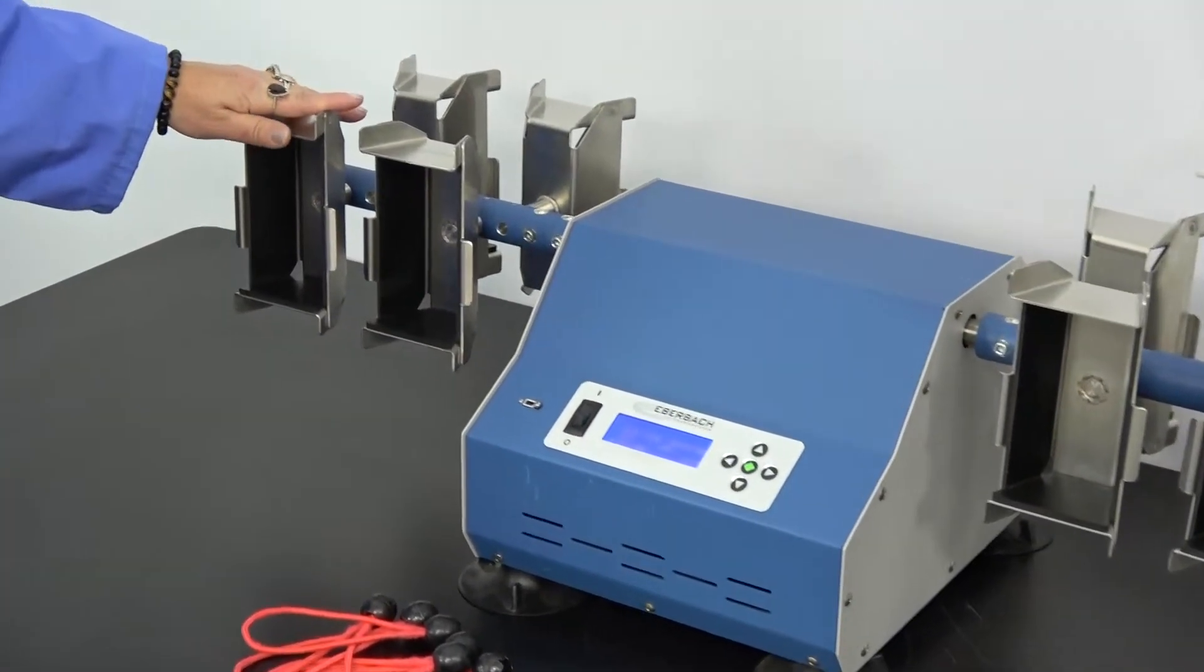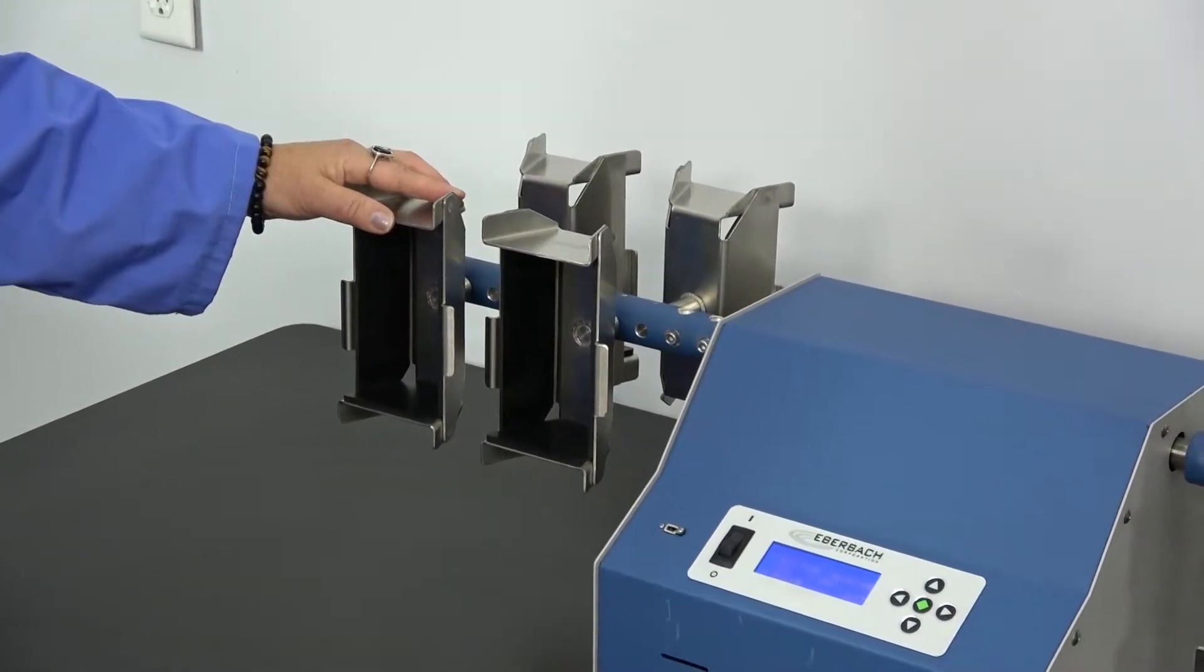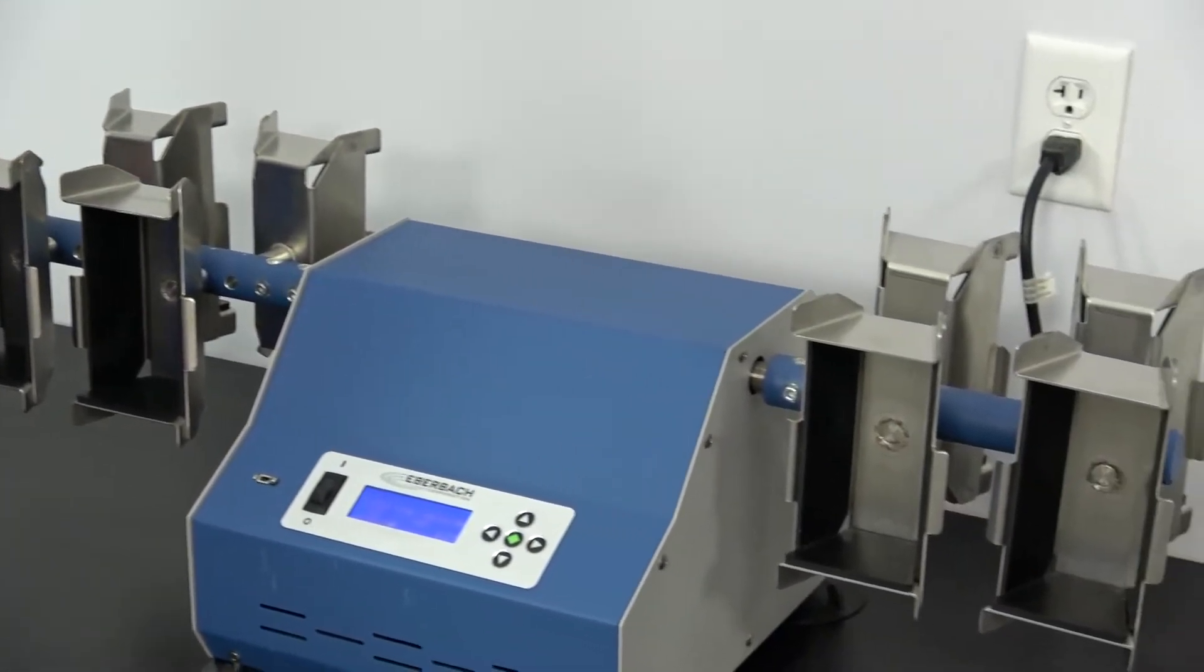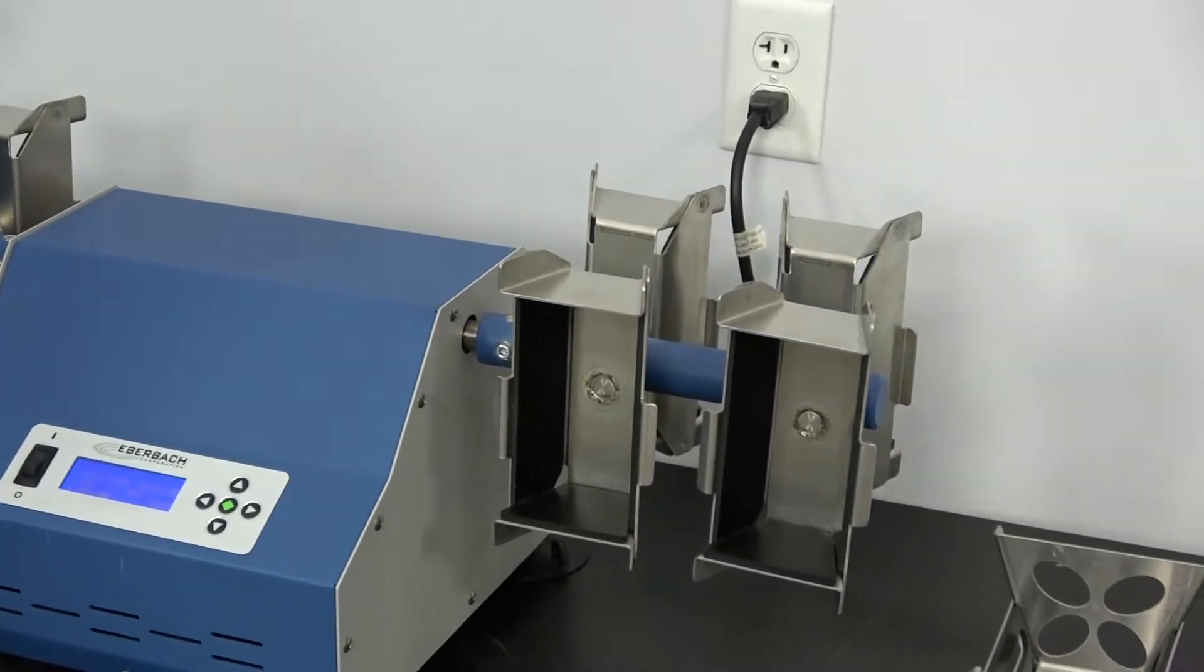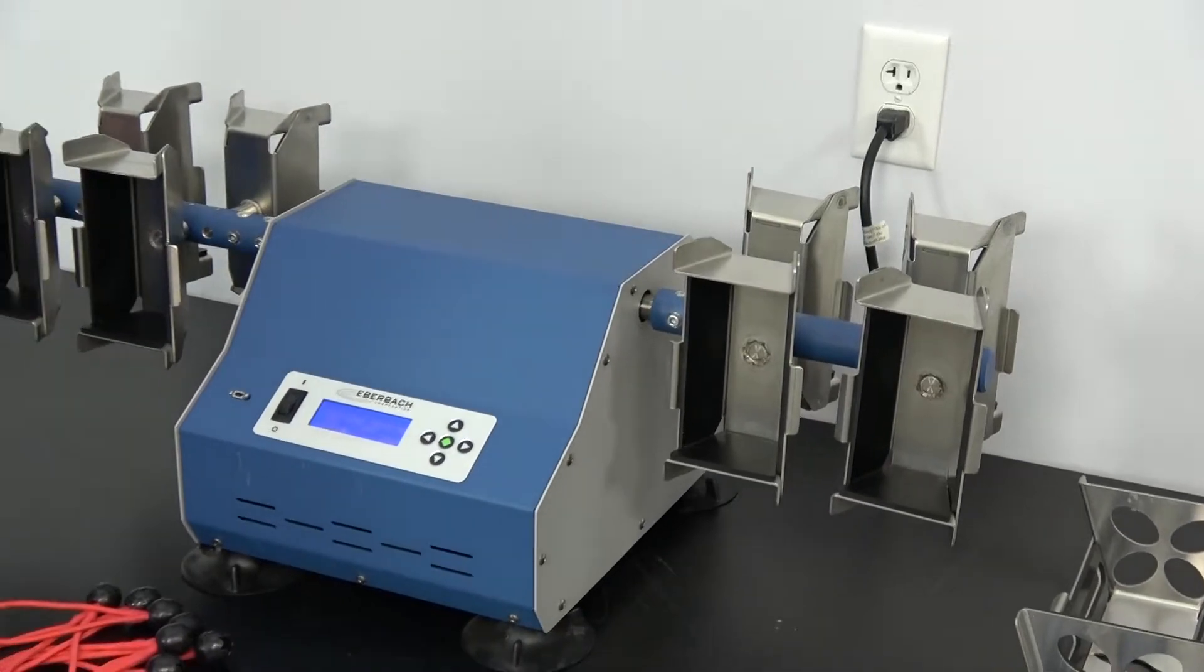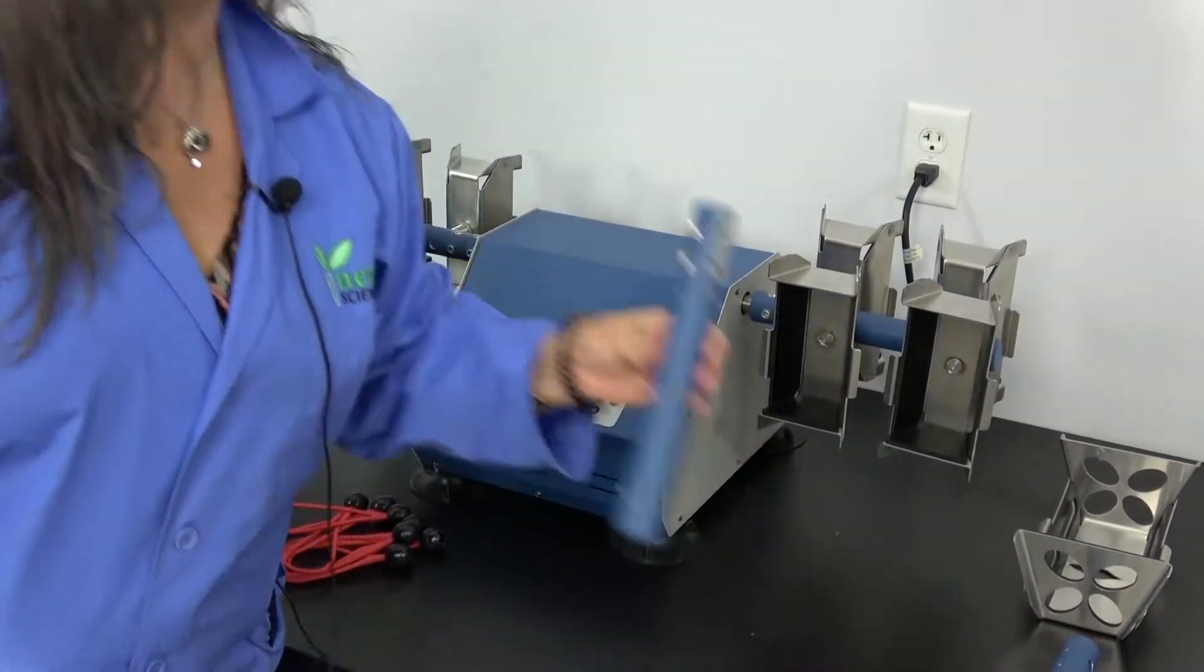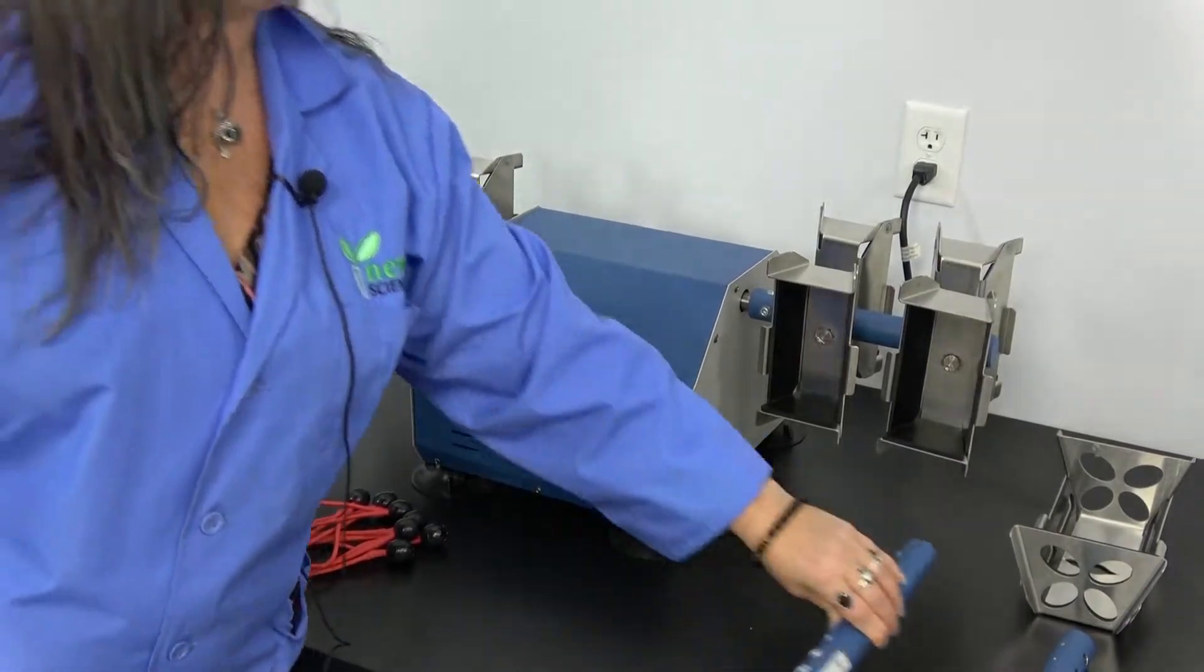This particular unit features eight clamps. The clamps allow for the attachment of various vessels, whether that be jars, flasks, tubes, whatever you have. These are detachable and can be switched out for some of the other attachments that come with it.